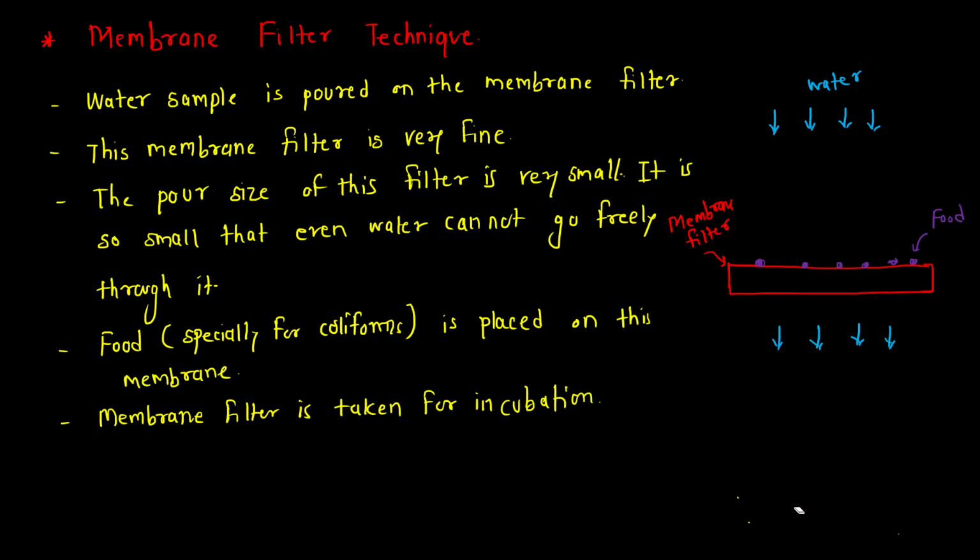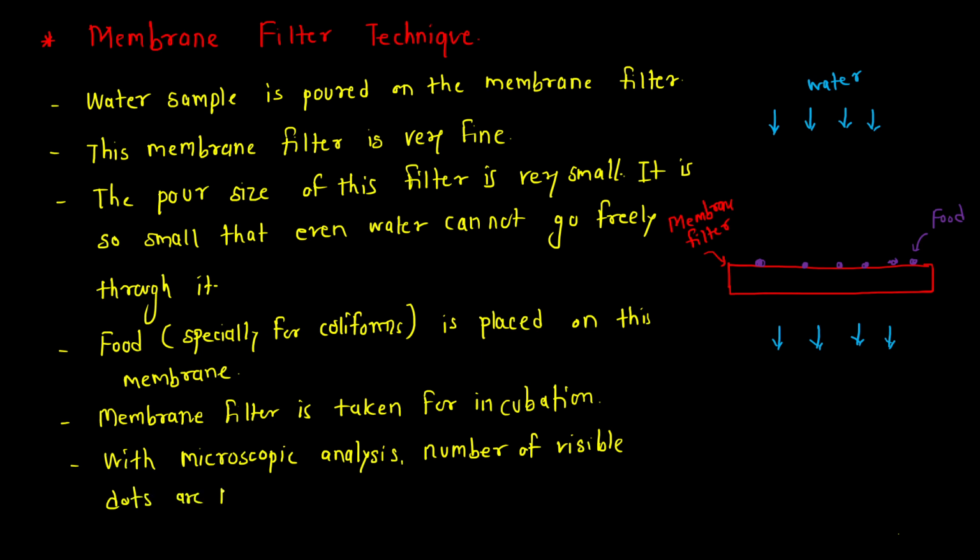Now, our membrane filter is taken for incubation, and after this, with microscopic analysis, the number of visible dots are found on the membrane.